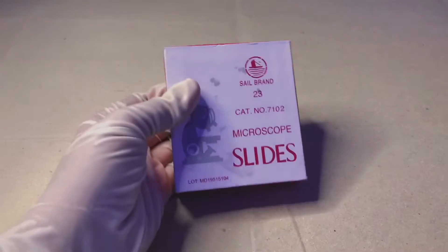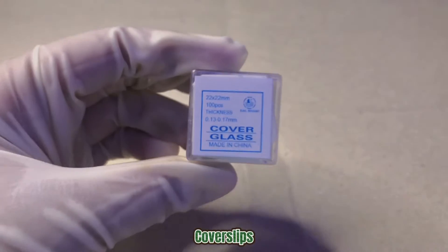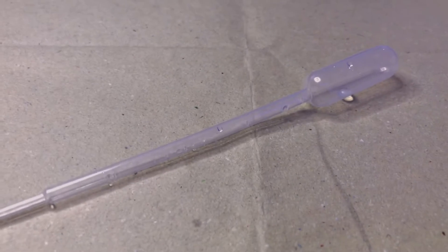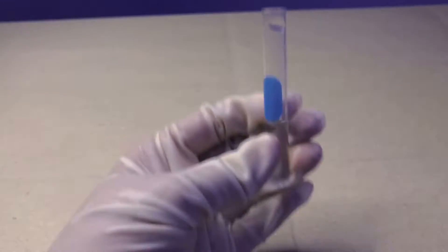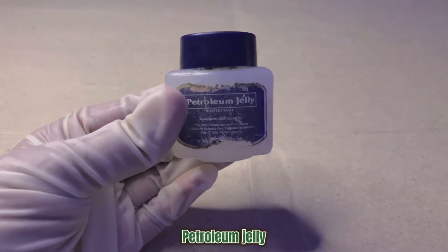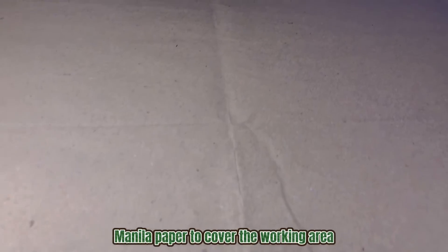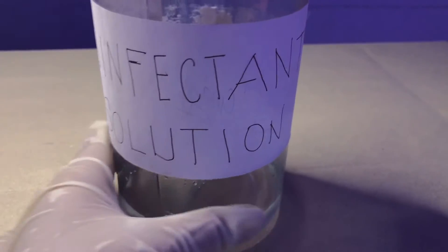Materials needed: glass slides, cover slips, pipette, toothpick, water sample, petroleum jelly, manila paper to cover the working area, and a white mouth bottle with disinfectant solution.